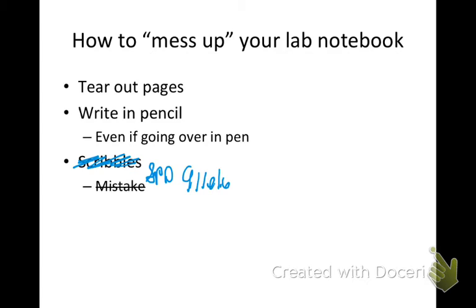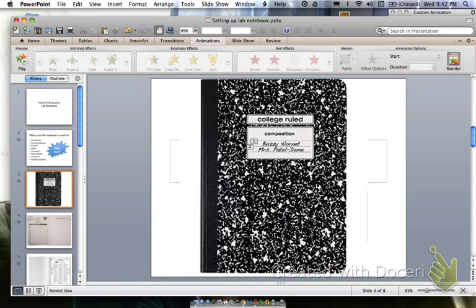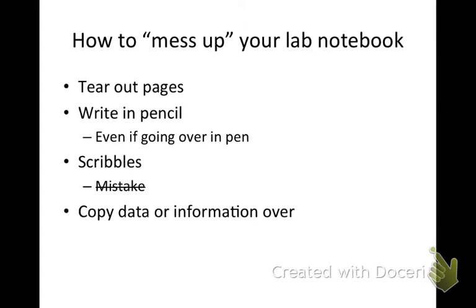Also, do not use whiteout in here. I forgot to write that down, but make sure you do not use whiteout in your lab notebook. And another thing, copying data or information over. That is also not allowed. That's how you will get points off.